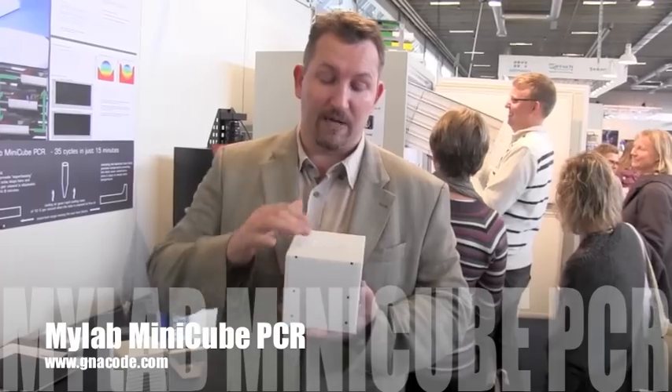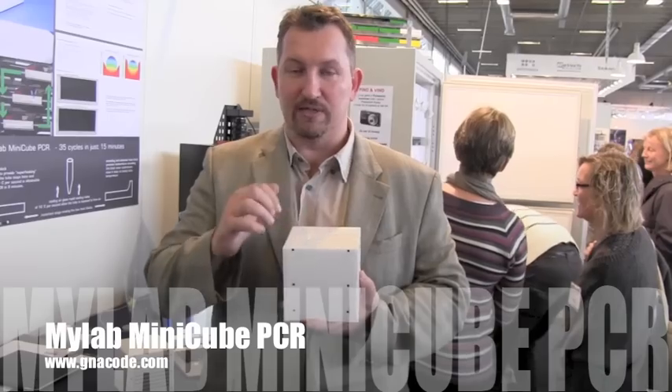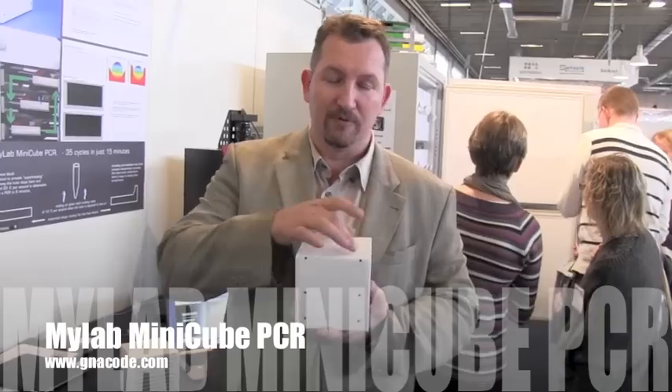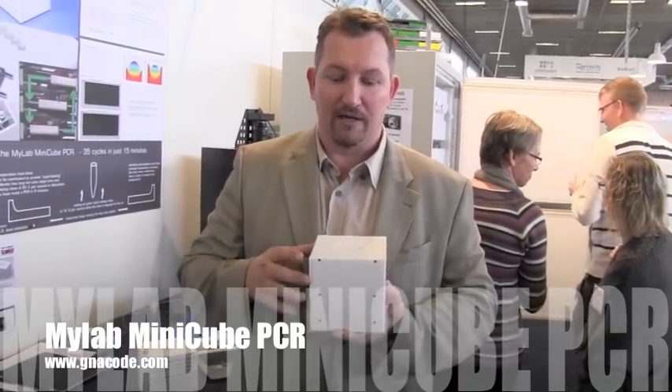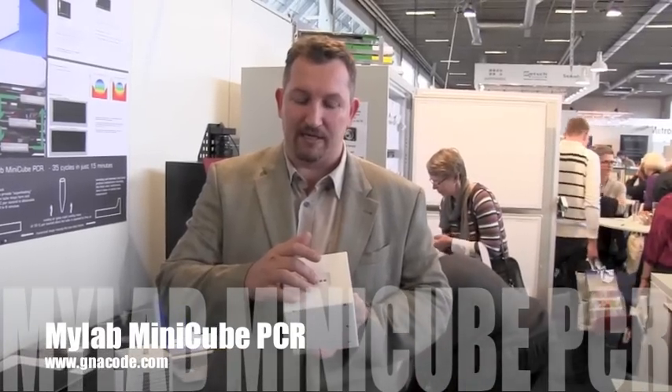The PCR is achieved by having a boat inside, and there are two heat blocks. The heat blocks are at steady state, and the boat moves between two positions, capturing the PCR tube which sits here at the top.